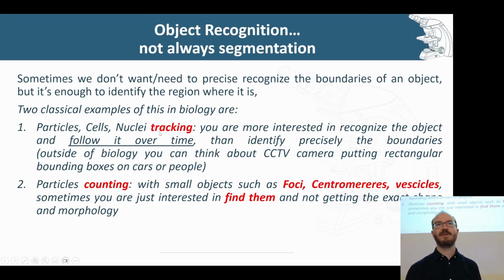Something like mitochondria is quite a lot harder to track. A little bit later this morning, I hope to get to mention a method that can track mitochondria, how they move around in the cell over time. But some things are harder to track than others.